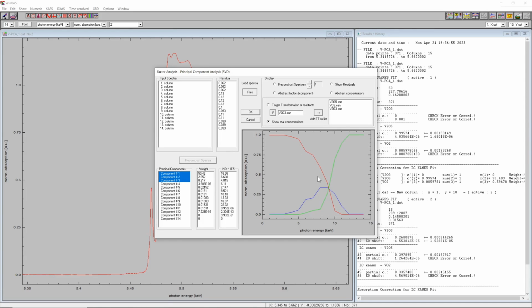This is possible to obtain in those cases. When your references are too perfect, as I mentioned in the first part, when they are too good to really correspond to the phase mixtures measured, for instance, under reaction conditions, then the agreement that you obtain from factor analysis and also from target transformation will not be as good as shown in this example.